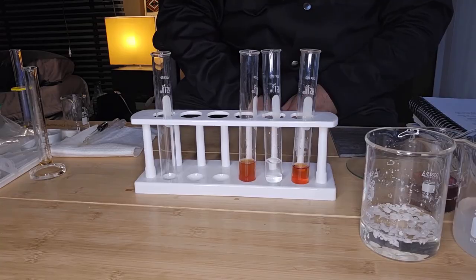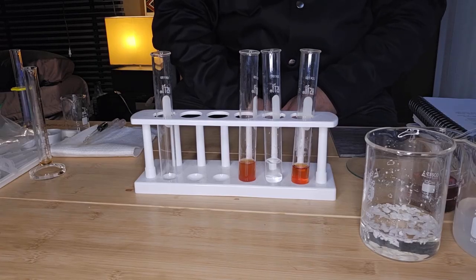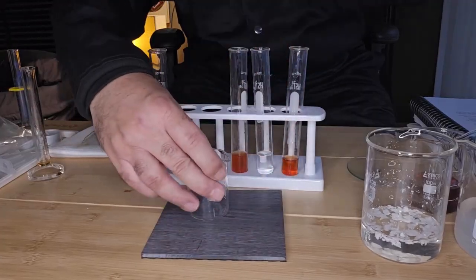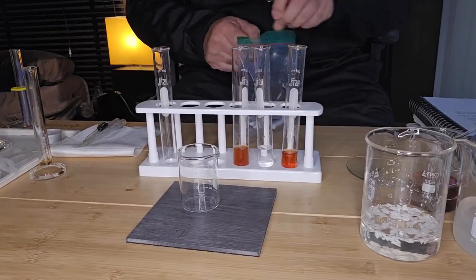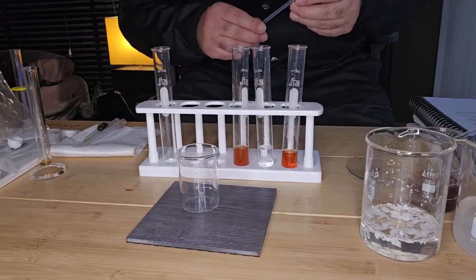So I'm going to measure out 2 mLs of calcium acetate into a 50 ml beaker. So I got my 50 ml beaker here, and I'm going to pipette 2 mLs. I can use a measuring cylinder, but it's quicker.